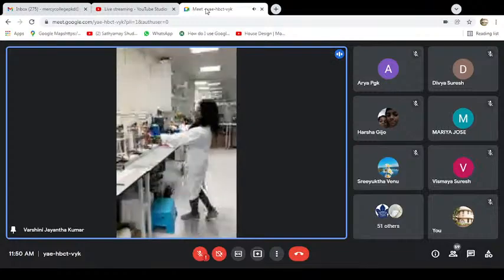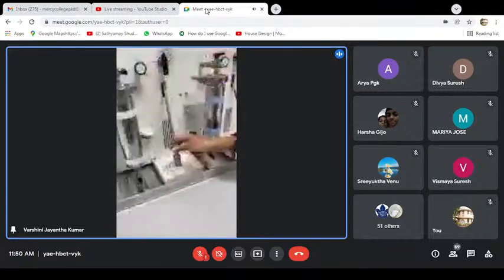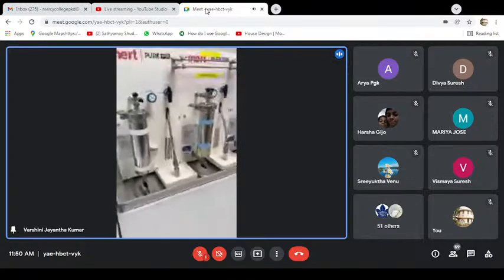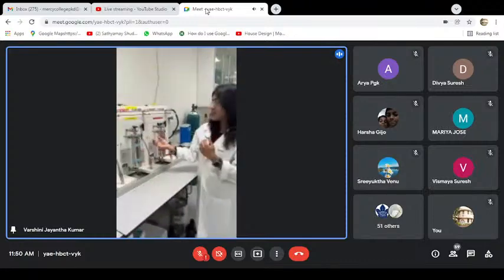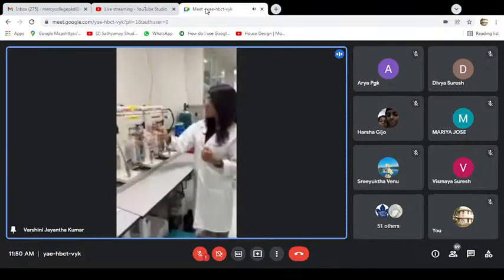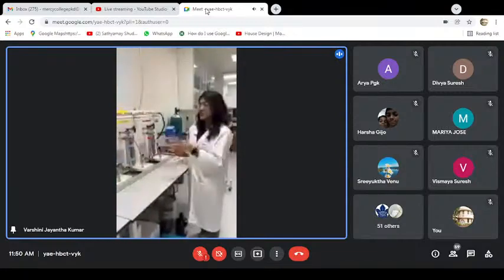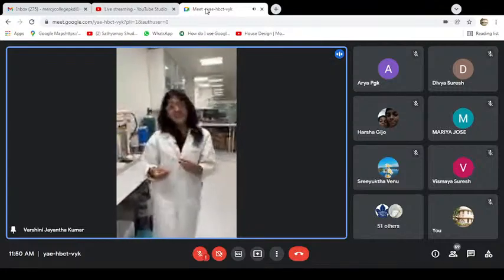So this is the SPS unit I was talking about. So using this tap, it will vent dry solvents directly into the solvent bulb without having the laborious task of distillation. So we can fetch dry solvents such as toluene, dichloromethane, and THF from this SPS unit. So this is a very handy piece of instrument that we have, which saves a lot of our time.